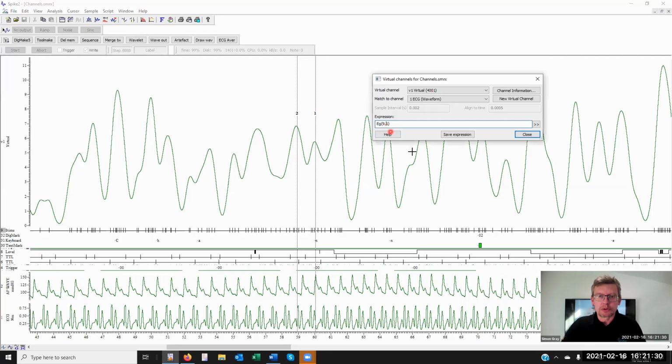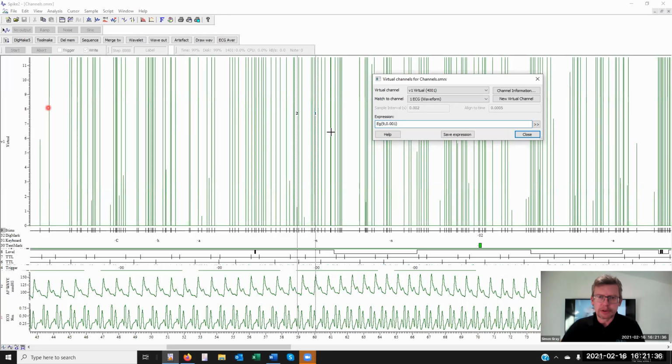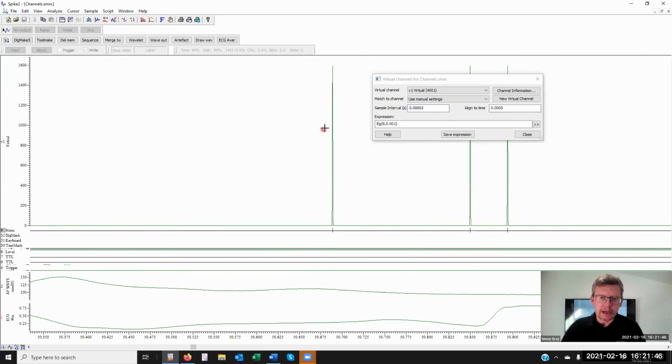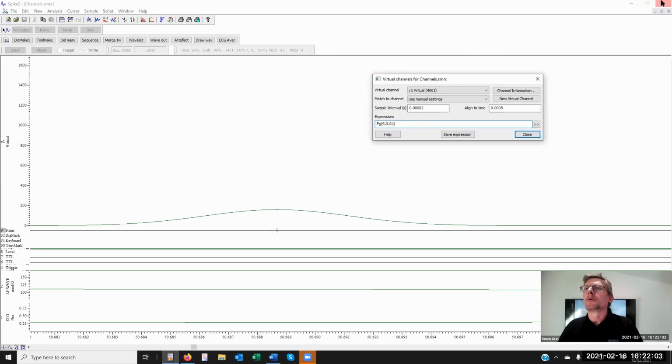If I change the width of the Gaussian, like so, you'll see, I'm just going to change the setting as well there for the sample rate. You can see the Gaussians fitted at each one of these data points. Now, these are symmetrical. We can ask for asymmetric data and other shapes, as you saw. Right, let's look further.